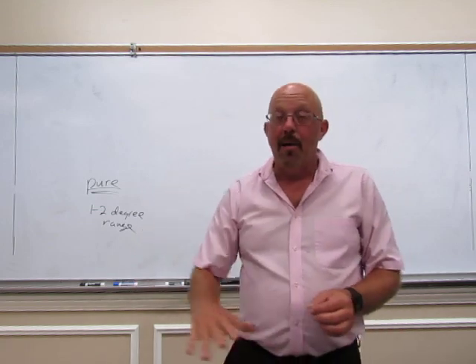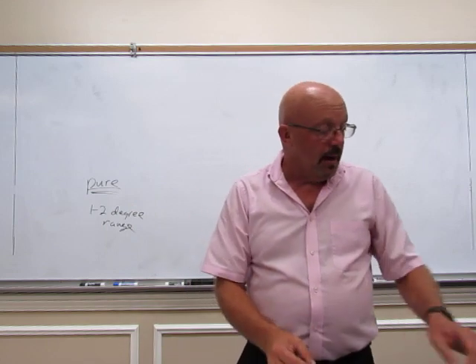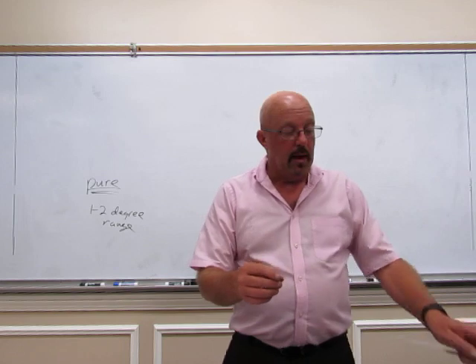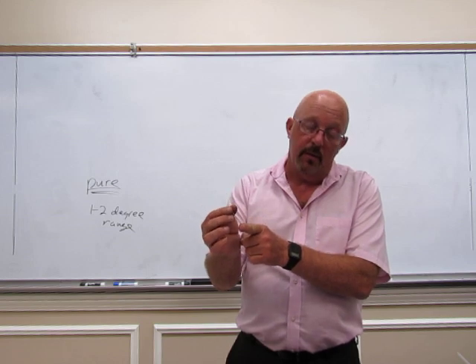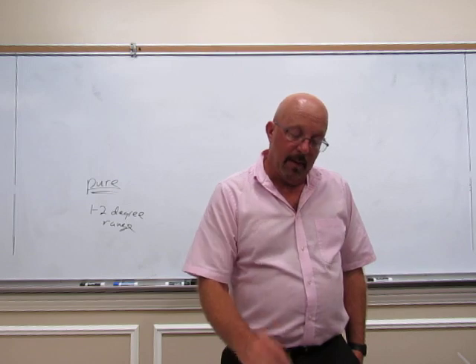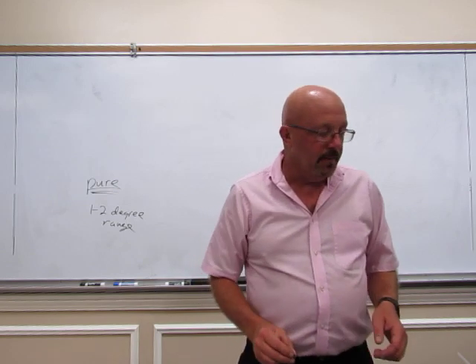The melting point apparatus has a magnifying glass on it, so you'll be able to see it plenty well. Now, we need to get it from the open end down into the closed end. So we need to tap it down. You can tap it on the bench with your hand, but it'll take forever.